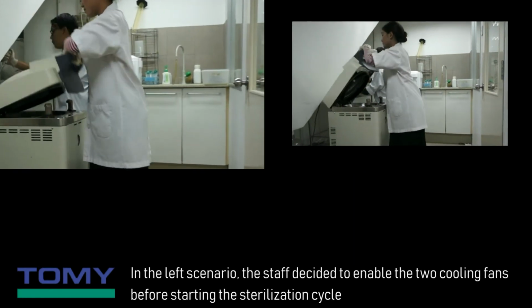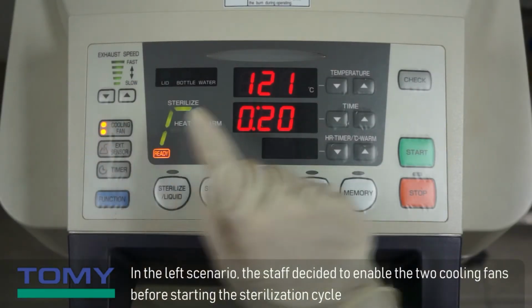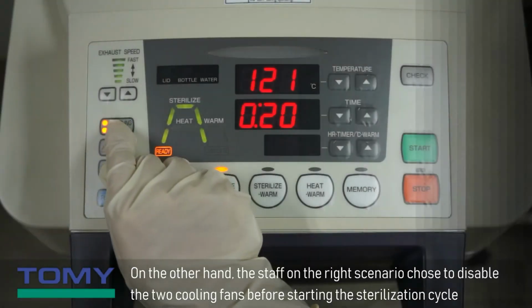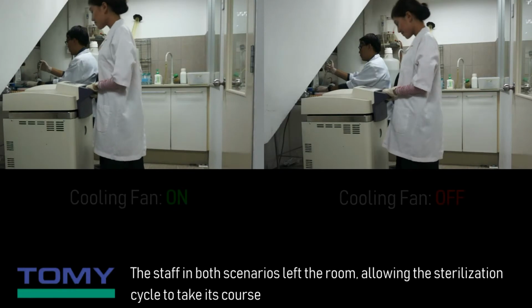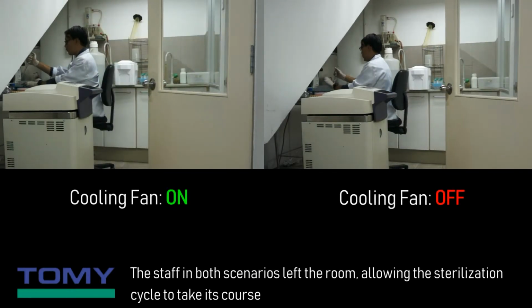In the left scenario, the staff decided to enable the 2 cooling fans before starting the sterilization cycle. On the other hand, the staff on the right scenario chose to disable the 2 cooling fans before starting the sterilization cycle. The staff in both scenarios left the room, allowing the sterilization cycle to take its course.